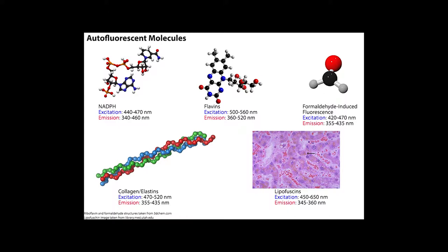Here's this handy chart for autofluorescent molecules. You can see there are reduced pyridine nucleotides — NADH and NADPH — oxidized flavins, FAD, and lipofuscins, which are a granular yellow-brown pigment resulting from the breakdown and absorption of damaged red blood cells, also known as the aging pigment. Collagen and elastins can also contribute. For samples treated with formaldehyde fixatives, the cross-links generated can also create autofluorescent molecules — another reason to avoid over-fixing your samples.